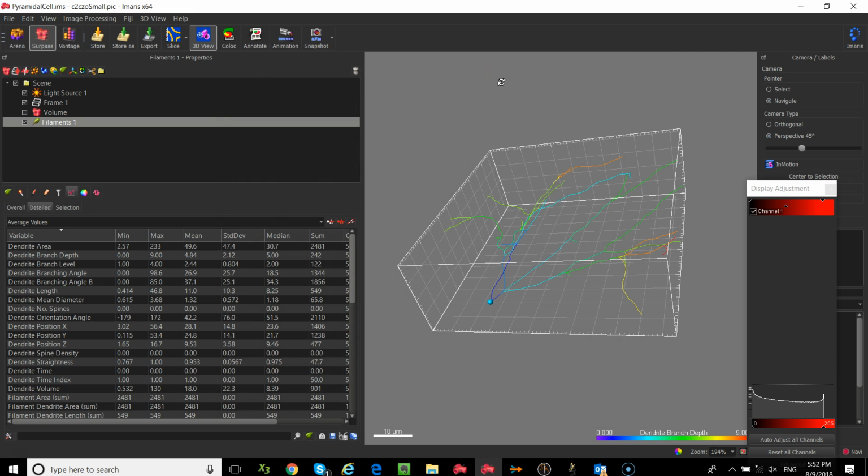I should ask at this point, are there any questions for the people that raised their hands and said they were interested in filament? Was there any questions that you guys had regarding this? Just that this could be applied for like a larger organ that would branch similarly, right? Absolutely. So because we're all running on these smaller systems, I'm using demo data, which is small.